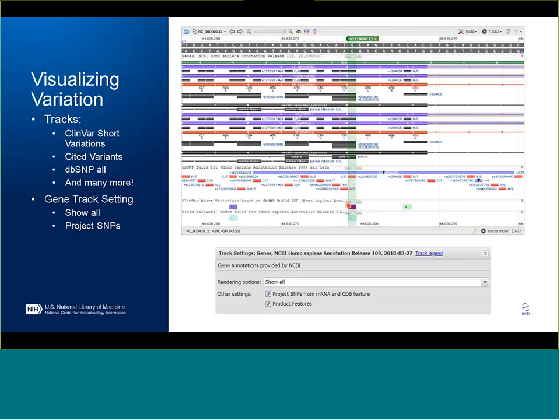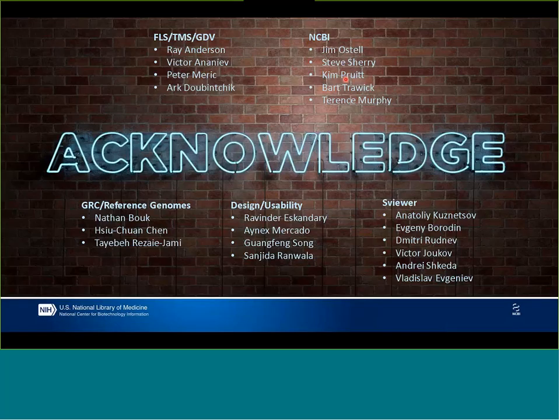The browser is a really nice way to get an overview of variation in the region and the annotation, and then link back to other NCBI resources for additional details. The genes track also lets you see SNPs projected from features like the transcripts and the CDSs. You can turn these on through the configuration menu under tracks — go down to the track setting, find a rendering option to show all, which will get you the transcripts and the CDSs, and then you can turn on this projection. So you can see those SNPs right on the gene track. I'd like to acknowledge the many people who were also involved in the production of this tool.